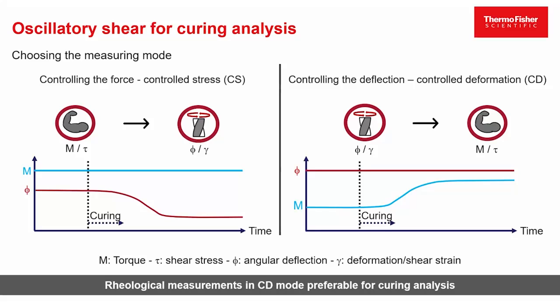In general, the ability for a gentle detection of a structure buildup during a curing is a big advantage of the CD mode. Therefore, it is the preferable mode for curing analysis.